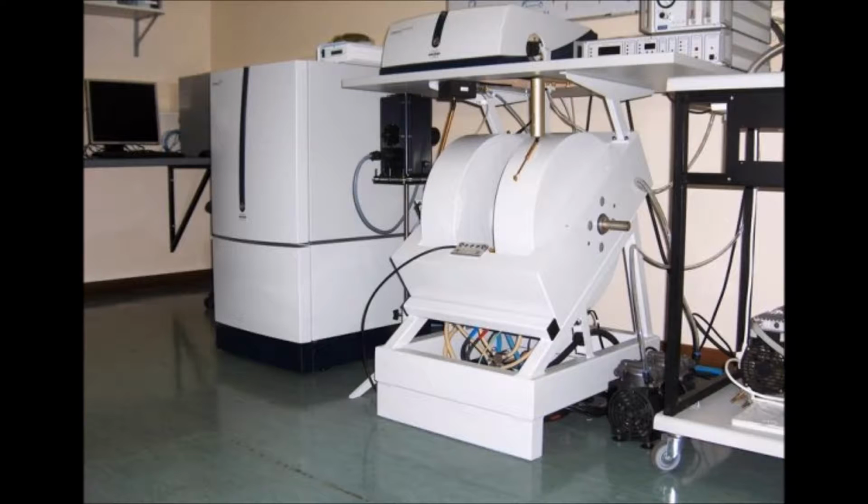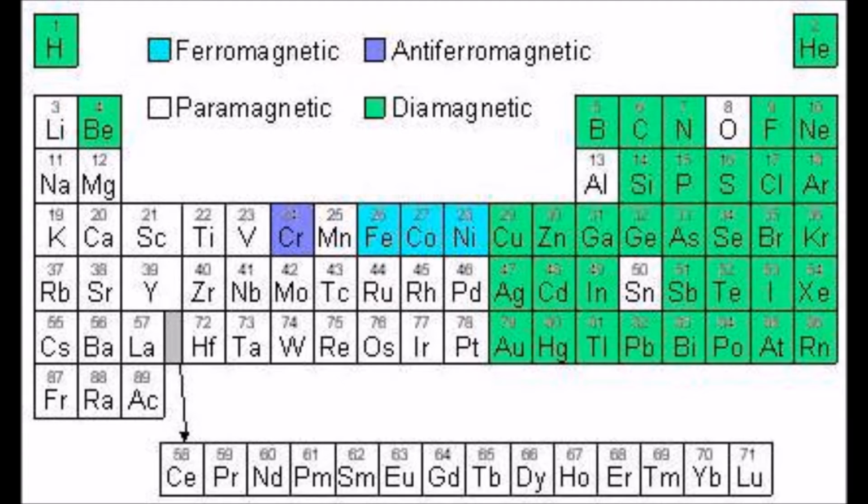Electron spin resonance was first observed in 1944 by Soviet physicist Yevgeny Zavoisky and developed independently at the same time by Brebis Bleaney at the University of Oxford. Electron spin resonance spectroscopy, also referred to as electron paramagnetic resonance spectroscopy, is a very useful method for studying materials with unpaired electrons, such as metal complexes or organic radicals.